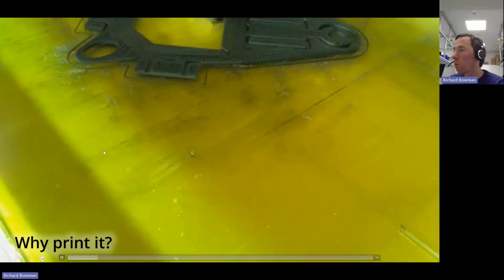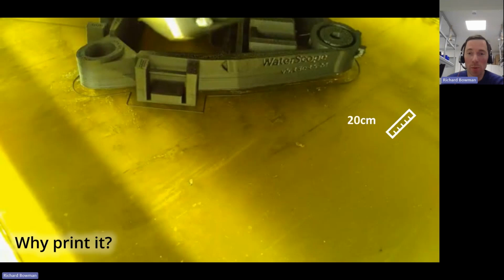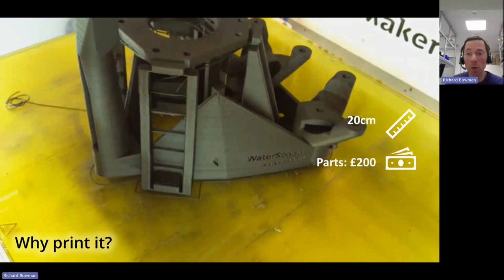So why would you want to print a microscope? For starters, it means we can integrate everything very tightly together, have it very small, fit it into places where a big microscope might not go. It reduces the cost, because a huge amount of the cost of a microscope is mechanics, and the 3D printing here makes it much cheaper. It also makes it easy to replicate, and I think this is where the project becomes exciting. The OpenFlexure microscope doesn't have many custom pieces, and the custom pieces it does have come off your 3D printer more or less ready to go.